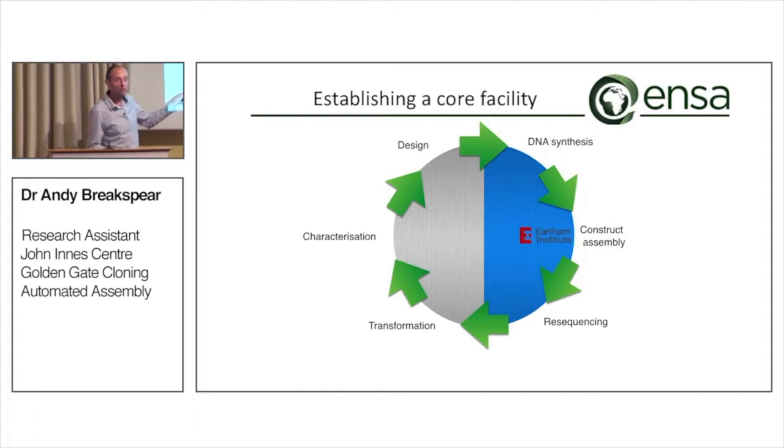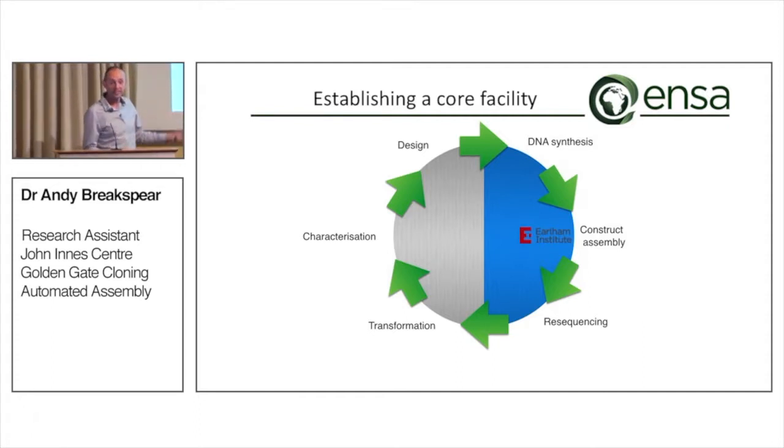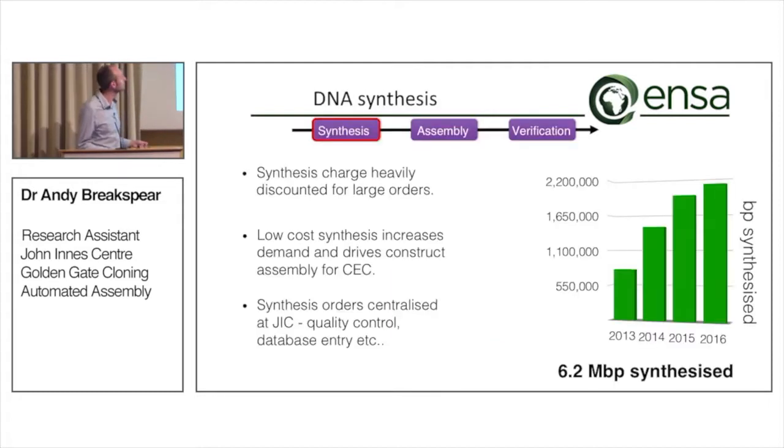This also had the bonus, of course, of doing assembly much more efficiently, much more quickly, more cheaply. So I'm just going to take you through this synthesis, assembly, and verification pipeline.